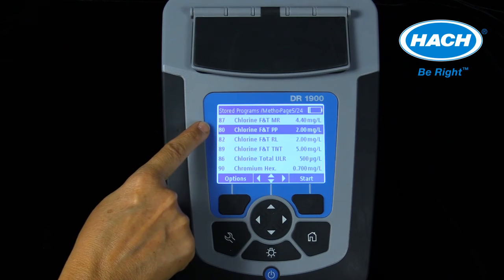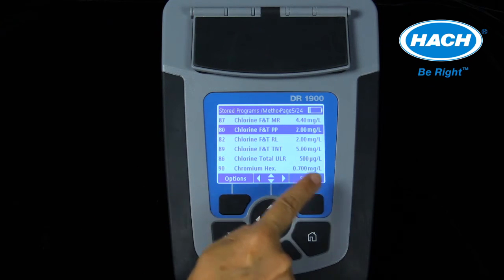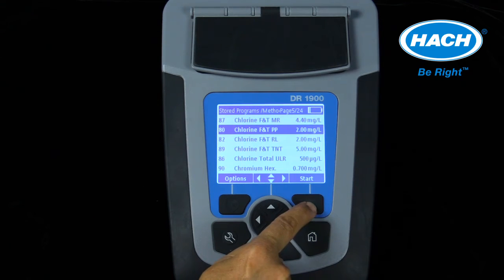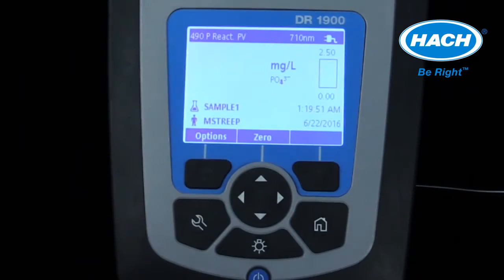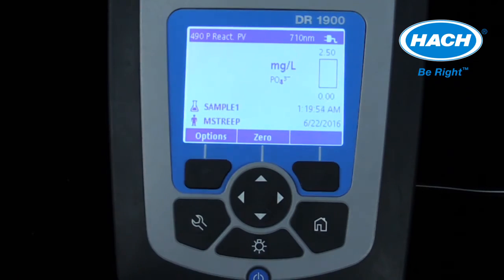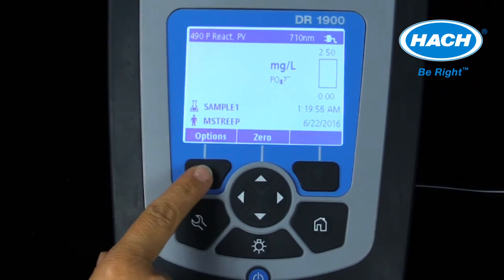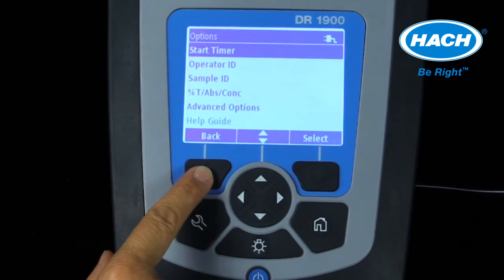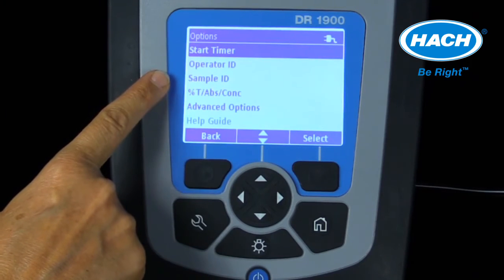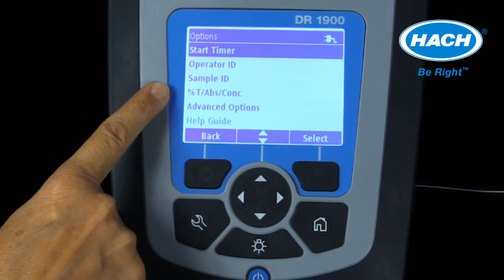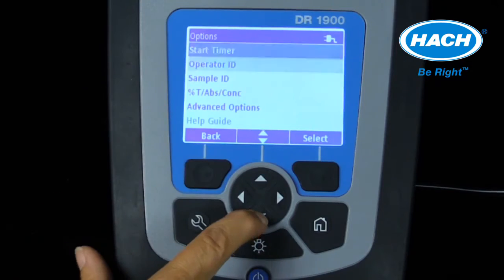In this example, we'll show the selection of program 80 entered by number. Once the correct program is entered, select that program by hitting the key under Start. Once in a program, the options menu will allow access to the following menus: a timer function, entering in operator or sample ID, making a measurement as a percent transmittance or absorbance value, and other advanced options.